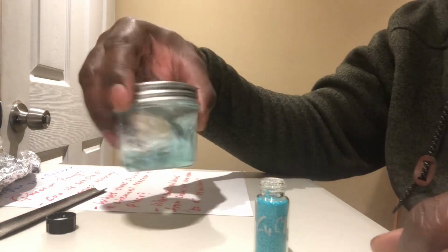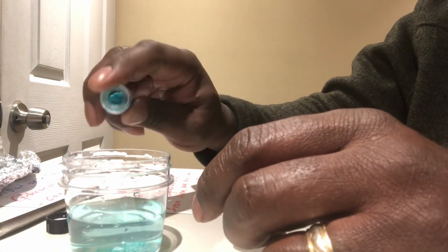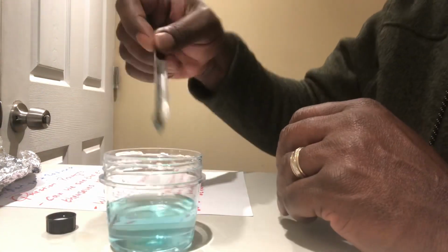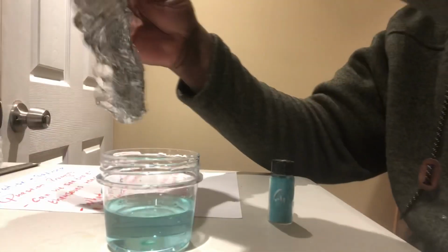Give it a swirl. Okay. Alrighty. Put a little more crystals in there. Should be good. Okay, and now we're going to take a small bit of aluminum and pop it in there and see what happens.